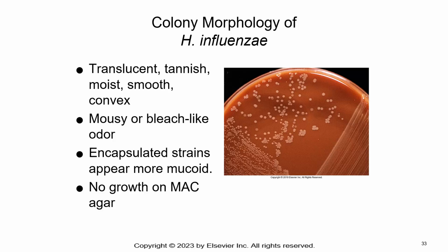This is the colony morphology of H. influenzae on chocolate agar. It has a mousy or bleach-like odor. Encapsulated strains may appear more mucoid. There is no growth on MacConkey agar. If you remember from way back in the beginning of the semester, we talked about MacConkey agar and how it's typically used to isolate gram-negative bacteria. These gram-negatives won't grow on it.